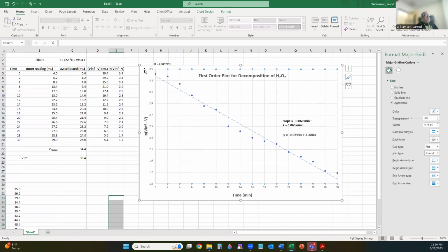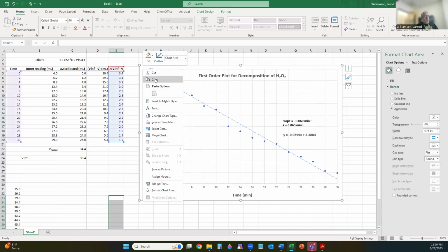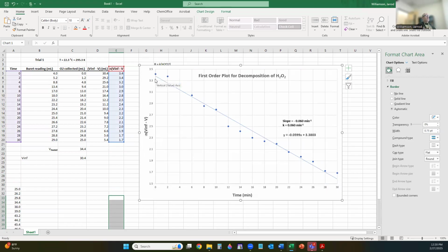Okay. So then I'm going to take this picture, copy it, then I'll go over and put it in Microsoft Word, expand it to the size of the page, right? And go from there. I'll see if it shows up here in my share screen. I hope it works. If not, you guys have seen me do that before. So right here, I'm going to go ahead and try and paste it in Microsoft Word. We'll see if it shows up now.